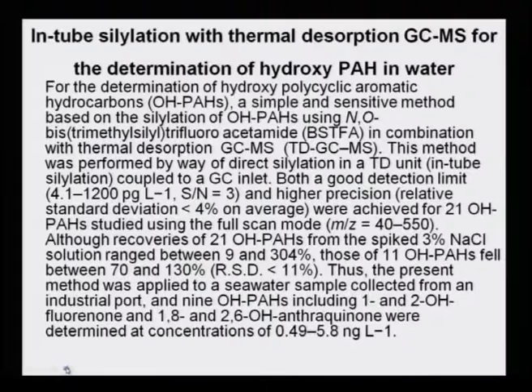For the determination of hydroxy polycyclic aromatic hydrocarbons, that is OH-PAH, a simple and sensitive method based on the silylation of the OH part of the PAH using N,O-bis(trimethylsilyl)trifluoroacetamide, BSTFA, in combination with thermal desorption at the GCMS was carried out.